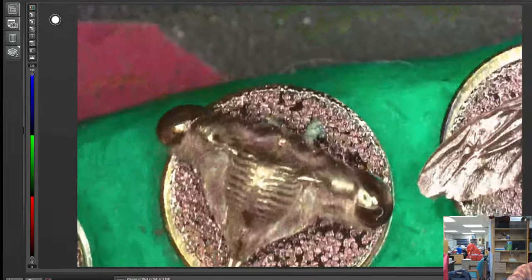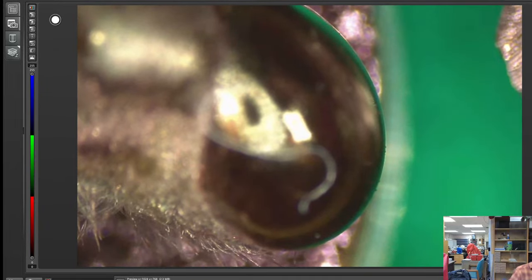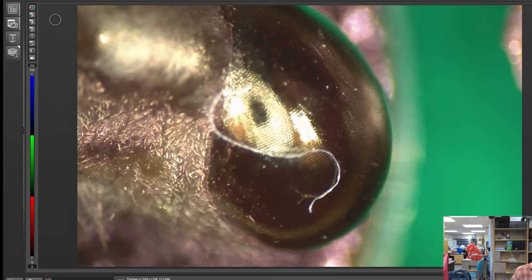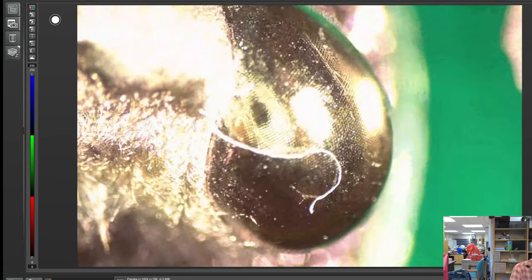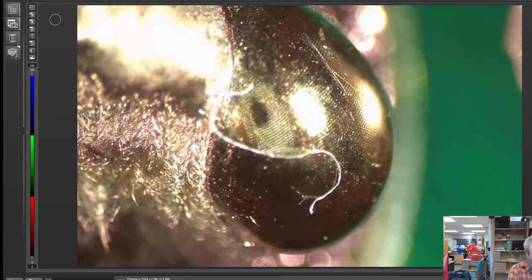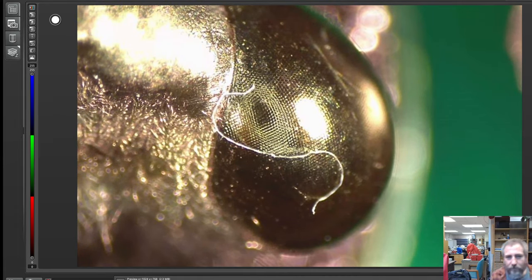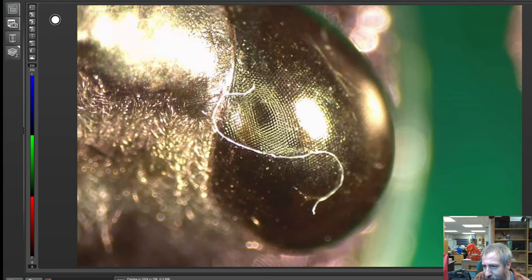So we're super zoomed out, of course, and I feel like we could probably get a good image of the compound eyes. There you can see them. And I'm going to put the lights on it. It's totally blinged out compound eyes. You can see the little facets of the eyes themselves, right? Like the front end of an old car, right?